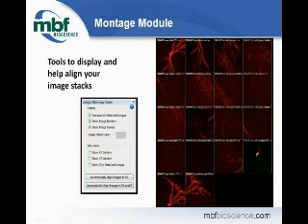So here's an example. We've got manually acquired confocal image stacks of overlapping fields of view of a single neuron. This set of images was acquired from outside of our application, in this case with the Zeiss LSM confocal. There are 18 stacks. All of them have different overlapping amounts, and all of them have various Z depths. So in other words, there is no system on how these should be put together in coordinate space. They just have image data that needs to be put together.